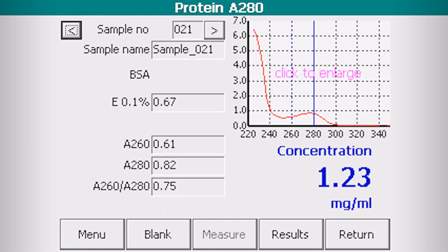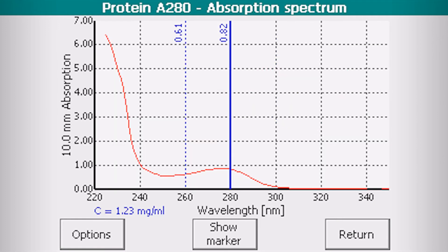See the concentration of your sample. You may view the spectra in full screen.